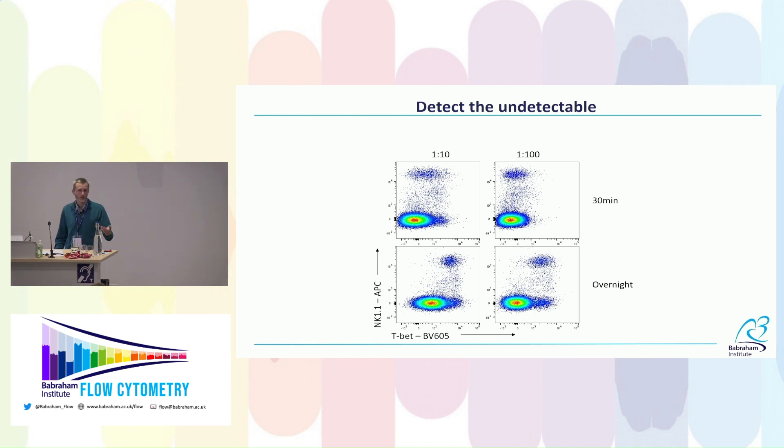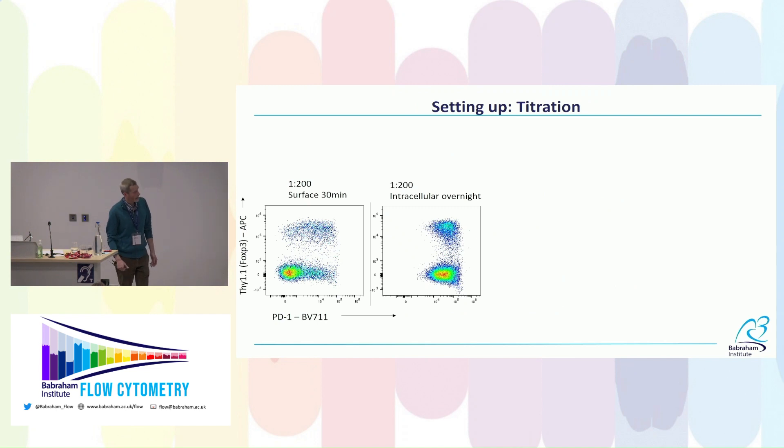More panel design flexibility: looking at NK cells, which express T-bet at relatively high levels, with a 30-minute staining at 1:10 dilution the entire staining mix is pink from BV605 — I can't separate NK cells, and adding more antibody just shifts the whole population up. Leaving it overnight gives the correct staining profile with NK cells shifting over. That means I can use T-bet with BV605 instead of PE, freeing PE for a different marker — better panel design choices.